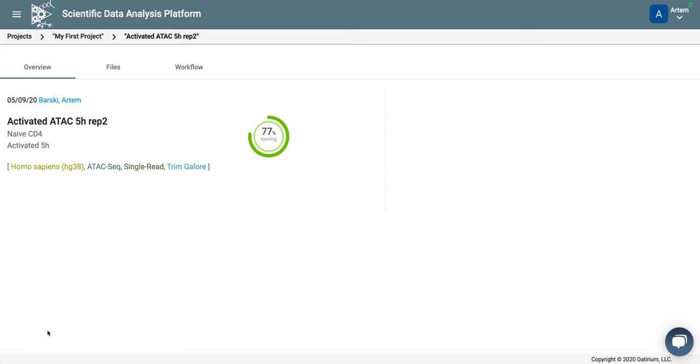Thank you, and in the next step we will look at how to do differential analysis of ATAC-seq data.